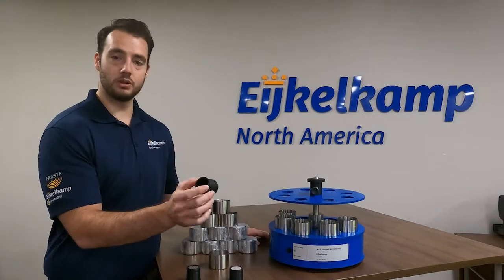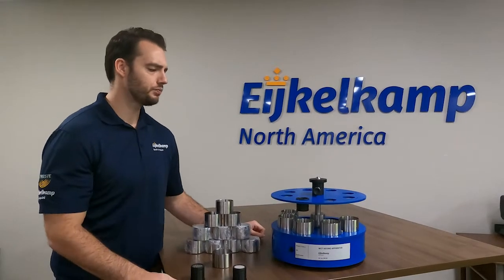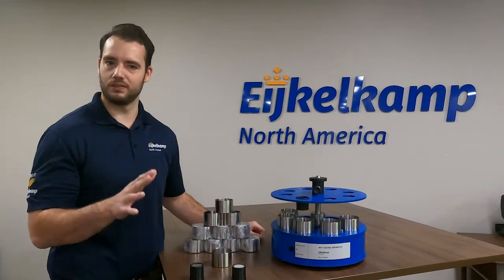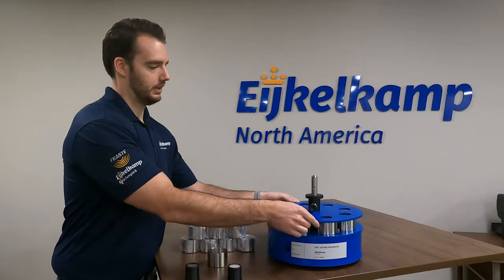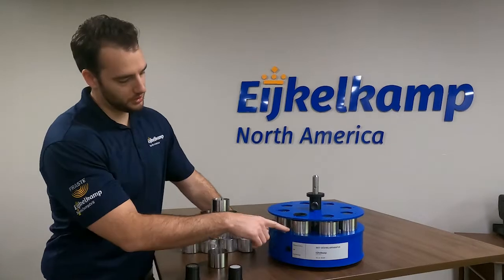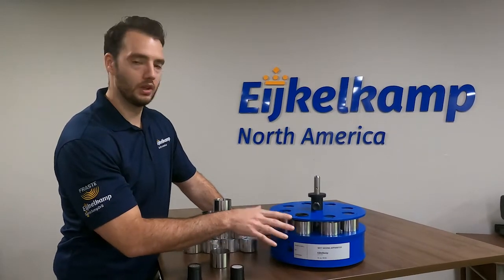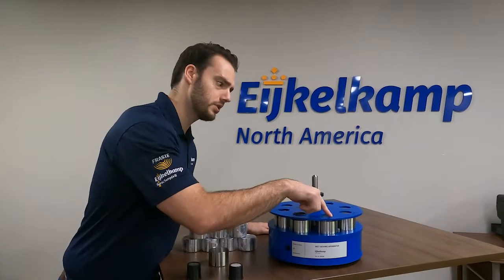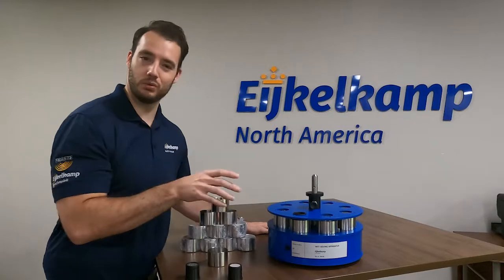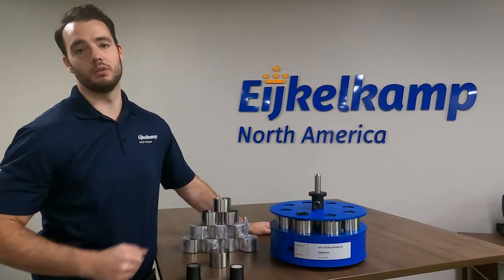What you'll do is take your dry, air-dried sample, add it here, and pop it into the holder. You'll typically wet your sample and let it sit five to ten minutes. Then you'll drop it down and pop it into place. Make sure the stainless steel cups are filled with DI water to the level that you want so the soil is submerged. There are little fill points in the top here so you can fill it with your DI water squirt bottle, then flip it on and let it run for three minutes.